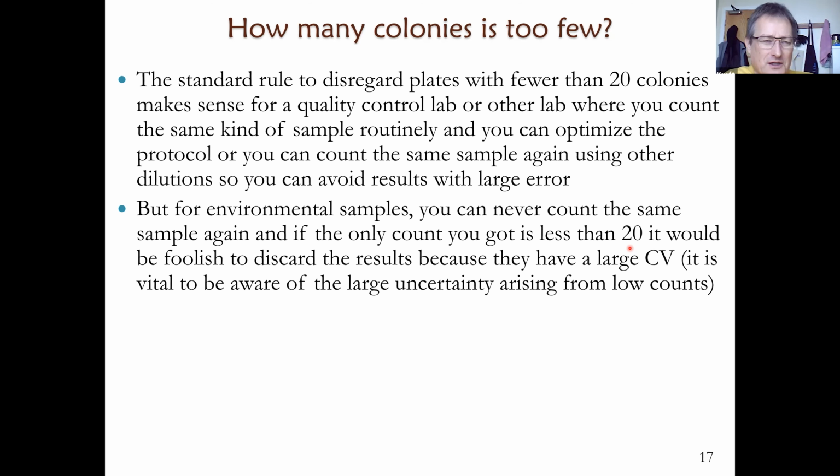But remember, this number is not that precise, as it's based on a count of 418. So we can then express the results in this way: 1.9 plus minus 0.09. And I'm not giving any more significant figures here. I was wondering whether I should introduce and explain the concept of significant figures, but I thought it's going to take too long, so I'm leaving that out today.